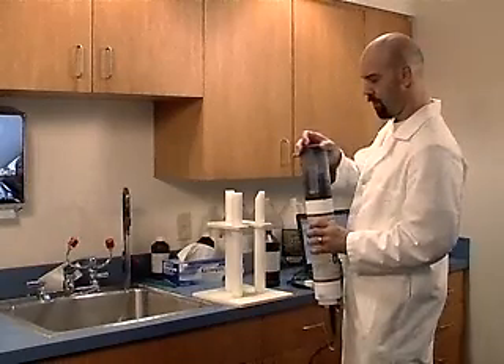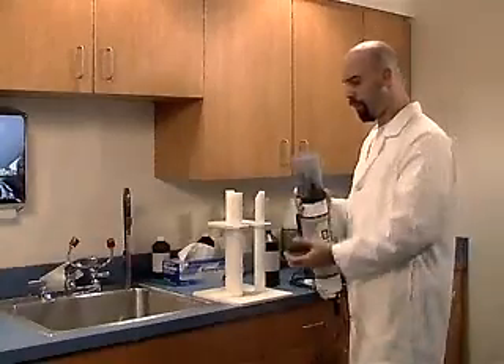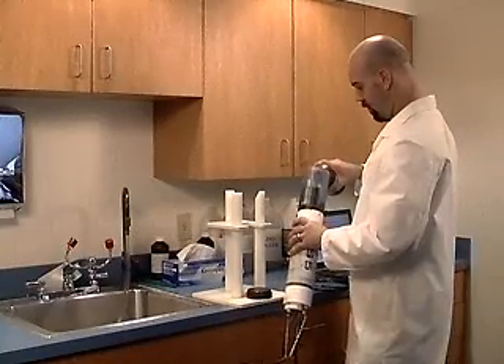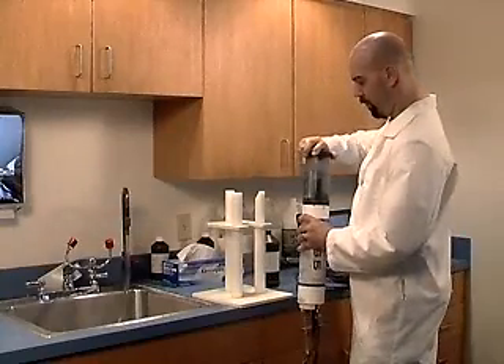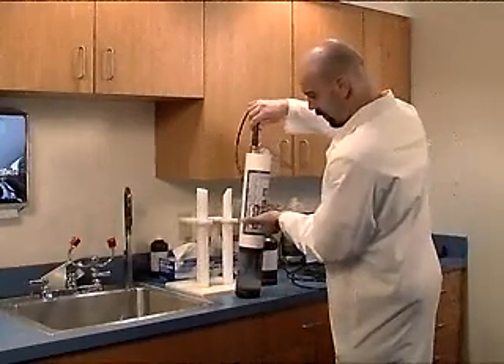Screw the cap on tightly and shake the sonde. Remove the cap and pour the solution out. Gently pour StableCal into the storage cup again, this time filling the cup to 75%. Screw the cap on and gently turn the sonde over so the sensors are pointing downward. The end of the self-cleaning turbidity sensor should be fully submerged.